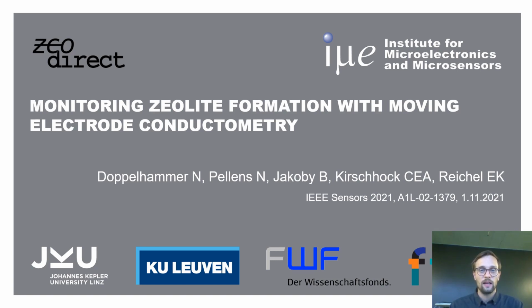Hello, my name is Nikolaus Doppelhammer. I'm a PhD student at the Johannes Kepler University in Linz at the Institute for Microelectronics and Microsensors. And today I want to talk about monitoring zeolite formation with moving electrode conductometry.